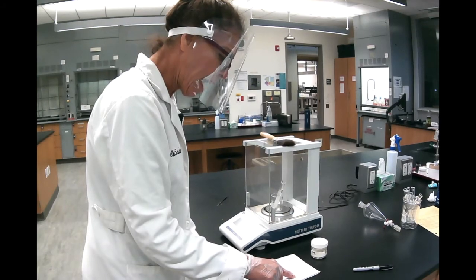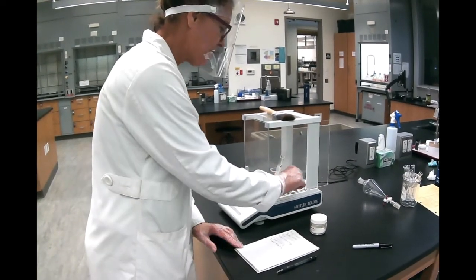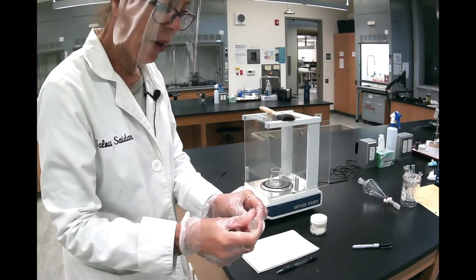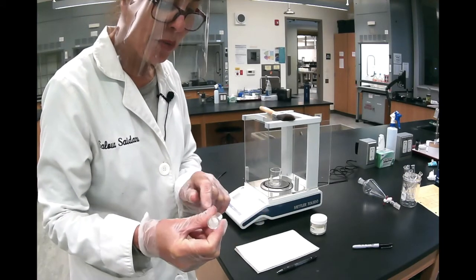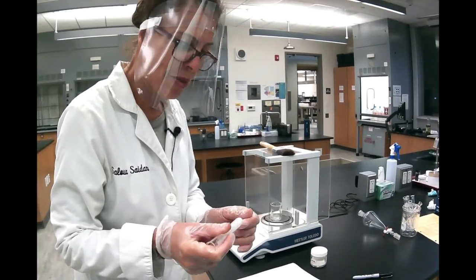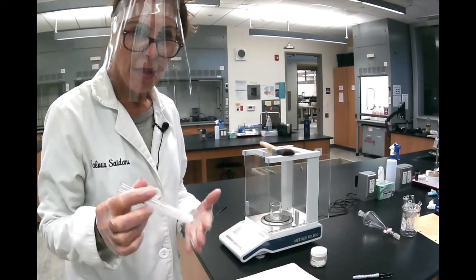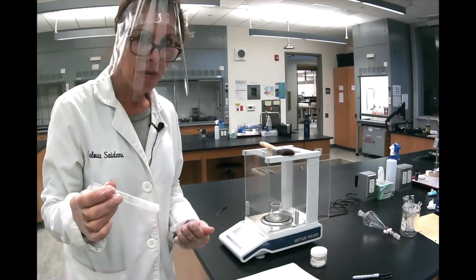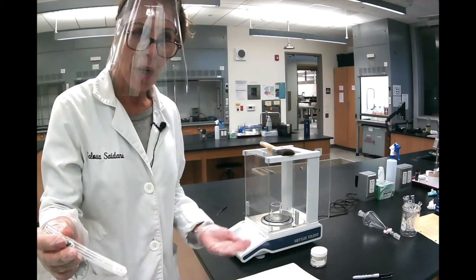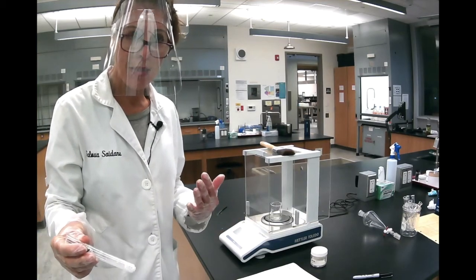If it's a little higher than what you put, what does it indicate? It indicates that you probably still have some water. So make sure when you're weighing your test tube, there's absolutely no water left whatsoever in it. So maybe one thing you could do is put it again, let it dry a little bit more, and weigh it again to make sure that the mass doesn't change.